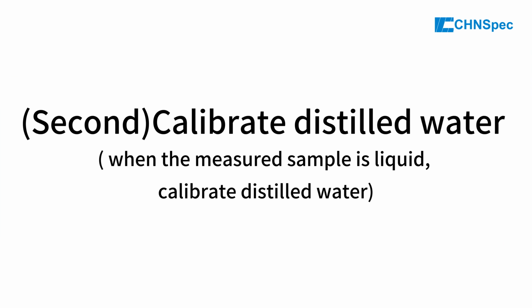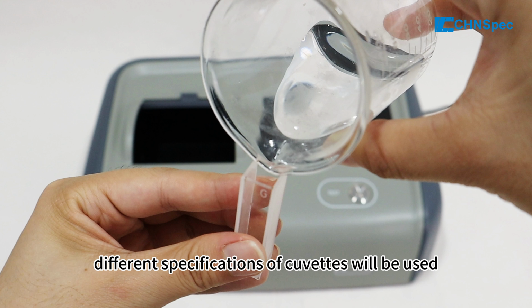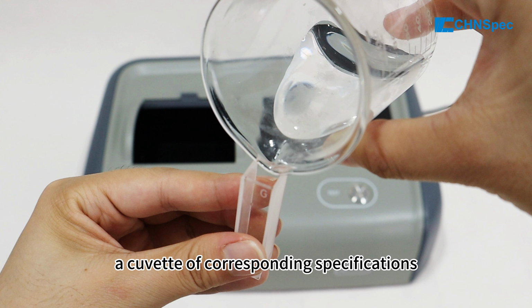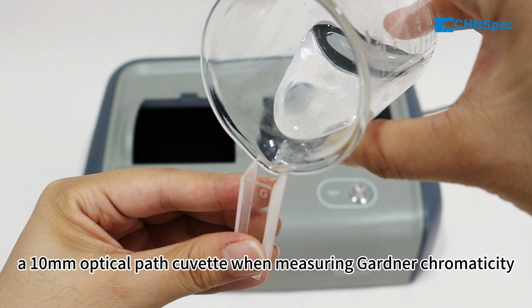Second, calibrate distilled water. When the measured sample is liquid, calibrate distilled water. Note when measuring the chromaticity of different liquids, different specifications of cuvettes will be used. When calibrating, please calibrate with a cuvette of corresponding specifications. Here, we demonstrate that the calibration is performed with a 10 mm optical path cuvette when measuring Gardner chromaticity.